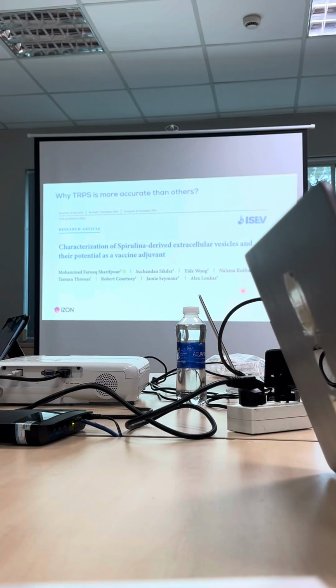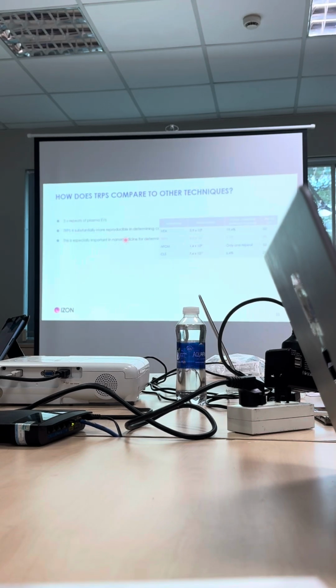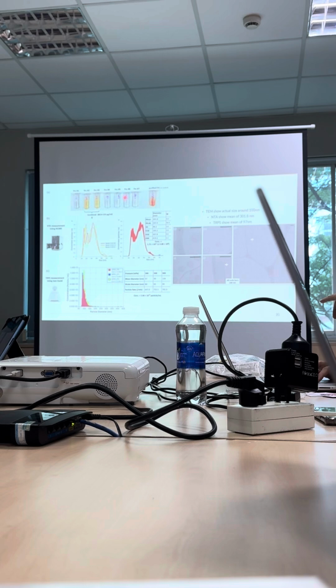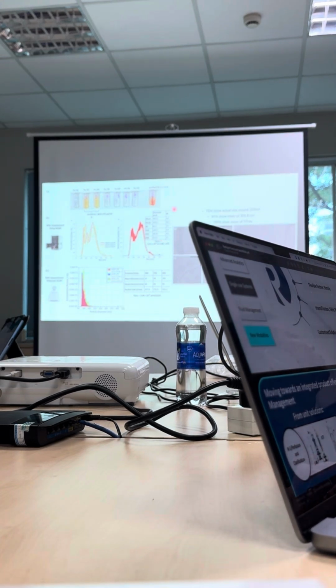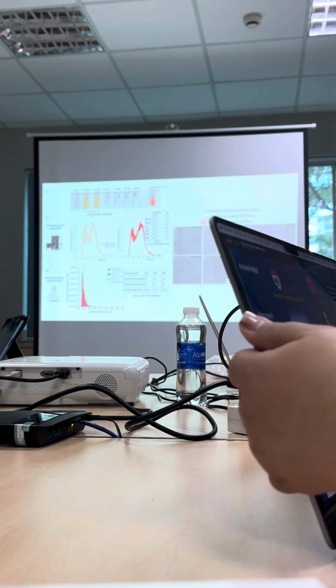And a very recent paper, published in the middle of last year. This one is doing in vivo studies. These studies used both NTA and TRPS to check the size and the concentration of the CCM samples. And the customer also sent the samples to TEM.